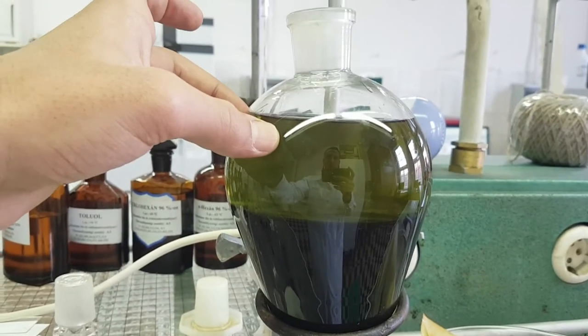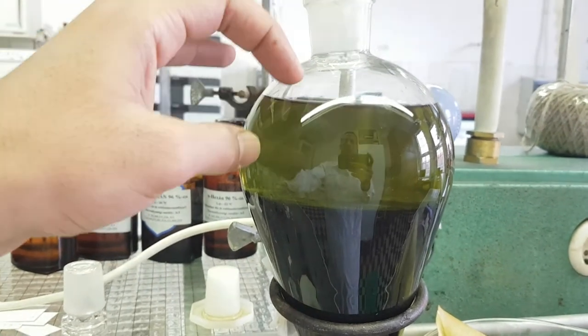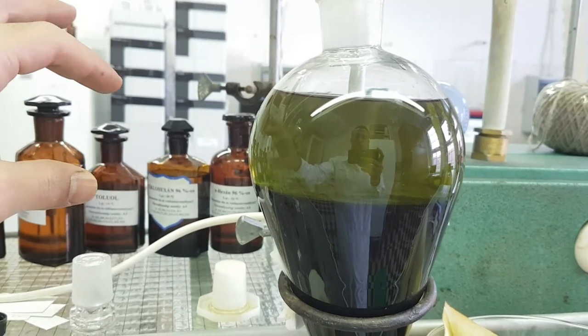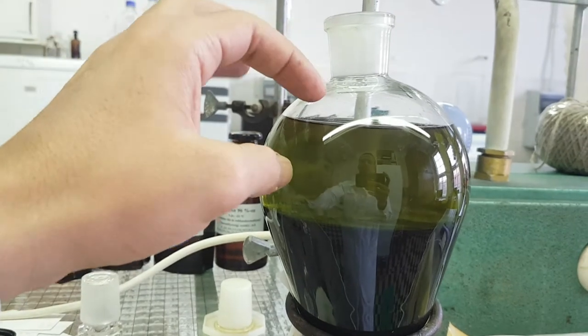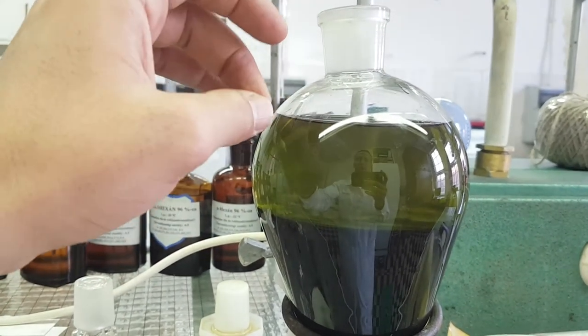Separate the aqueous layer and evaporate the organic one, then try to add the hexane a second time. If you still have a strong color, make an evaporation and try to add it a third time — repeat until the color gets weak.